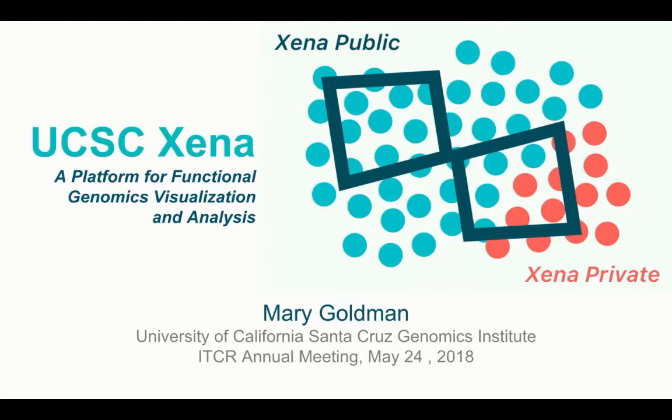My name is Mary Goldman, and this is a demo of UCSC Xena. Just to remind you, Xena is a visualization and analysis platform for functional genomics data. Xena allows you to view public resources such as TCGA, as well as your own data, and I'm going to give you a little flavor of both today.